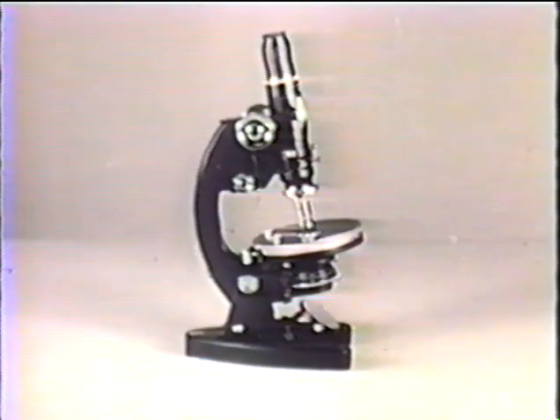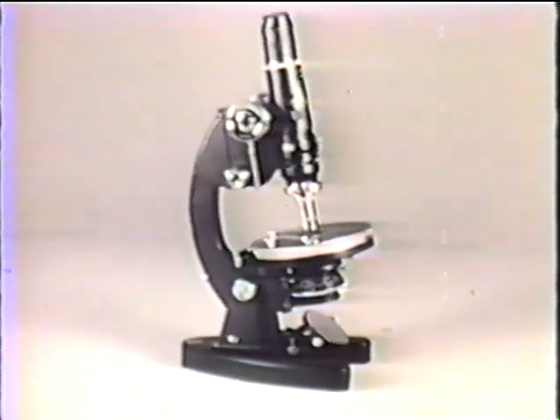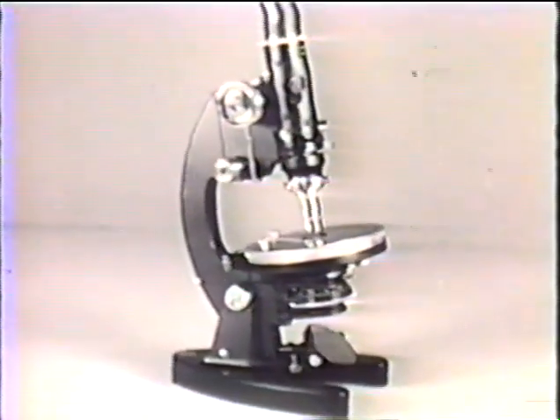The polarizing microscope has now become of outstanding importance for the study and identification of those orientated structures which lend themselves to examination by polarized light.